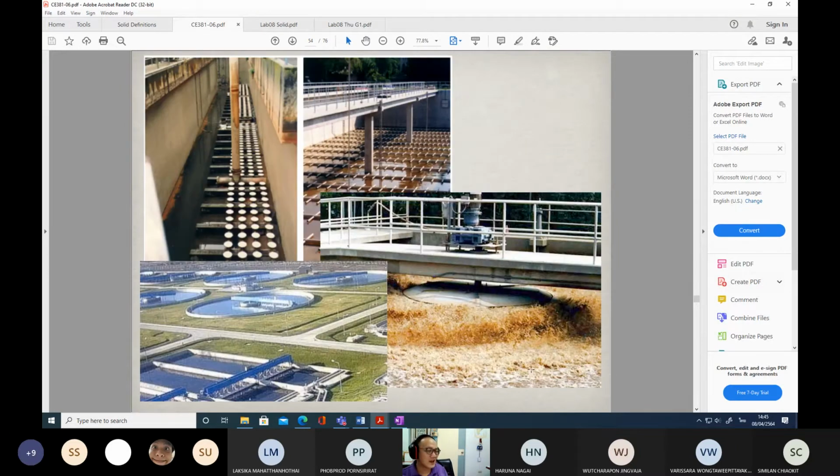The experiment I asked you to do in the last week before the final exams, we'll provide the conditions. Actually, we are going to conduct a lab-scale wastewater treatment. We'll provide the oxygen. We have the aerators. So our reactors will be something like this. In fact, these figures show a real, actual wastewater treatment plant. So we'll try to do the same thing.